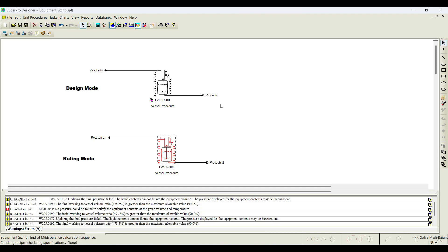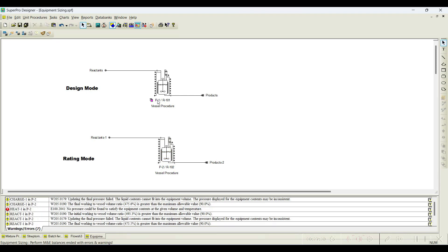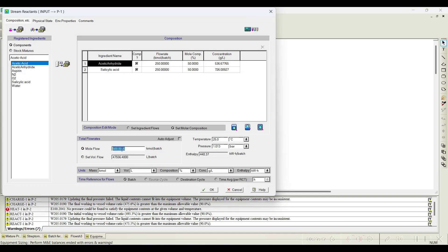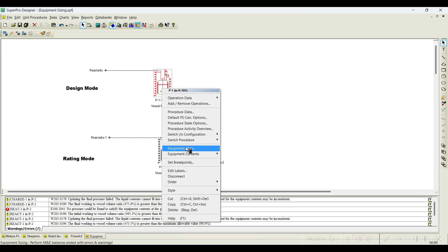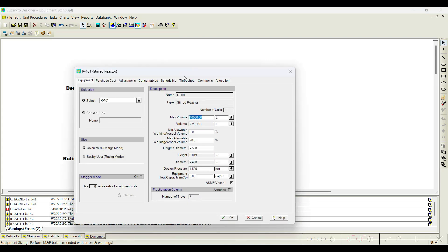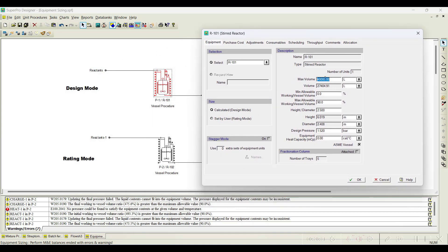Solve this. That error disappeared. I will change the input to 250 kilomoles per batch and simulate again — the warning symbol disappears. Going to equipment data, the maximum volume set is 40,000 liters, and according to the input of 250 kilomoles per batch, the required volume is approximately 27,404 liters — within the 40,000-liter limit.